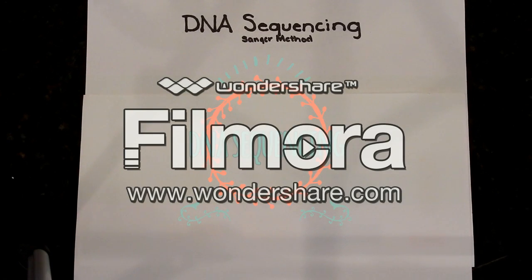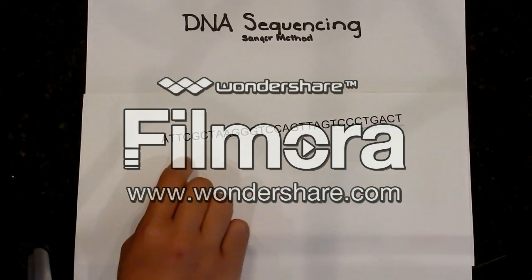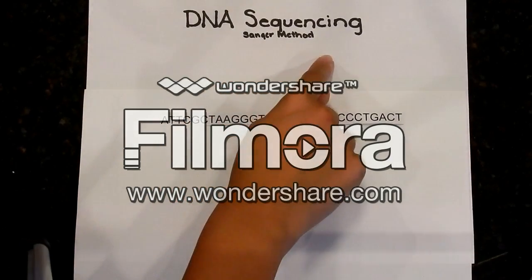Okay, so now we're going to talk about DNA sequencing. DNA sequencing is a process where scientists can determine the specific order of nucleotides of a DNA strand. Today, I'll be explaining the process of DNA sequencing using the Sanger method.